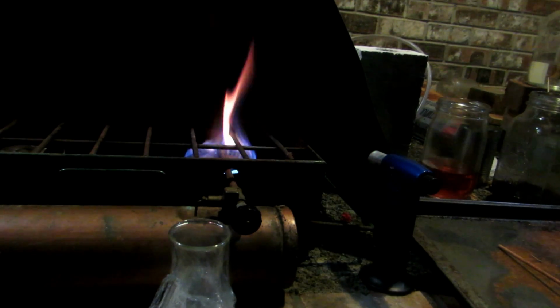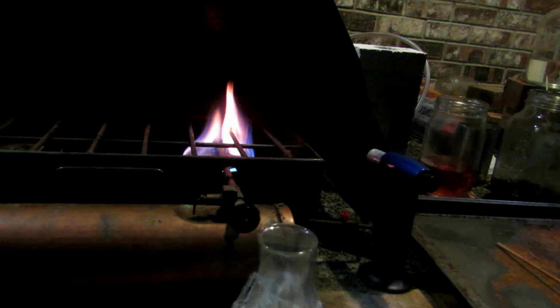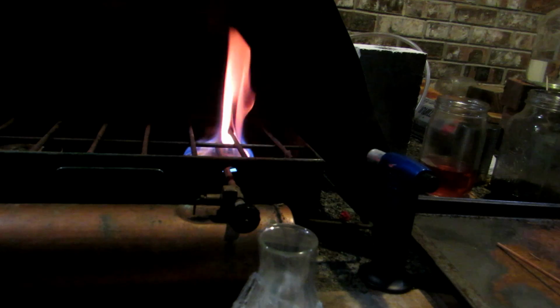Okay, so we just started the gas stove outside because this reaction is going to require in excess of 350 degrees Celsius to melt this sodium hydroxide here. So I weighed out 133 grams and I just sealed it off so it doesn't absorb moisture while we're getting ready for the reaction. This does need at least 350 degrees Celsius to work, because we have to melt the sodium hydroxide, and that will help increase the reactivity of it while it dissolves our silicon dioxide sand. Now, I did run this through a coffee grinder quickly, just to powderize it a bit better, so that it's much finer and hopefully the reaction works better.